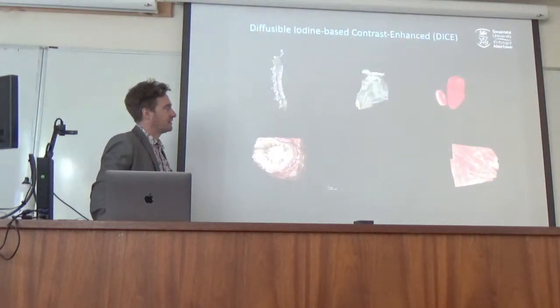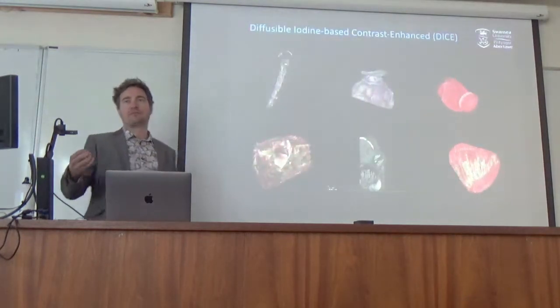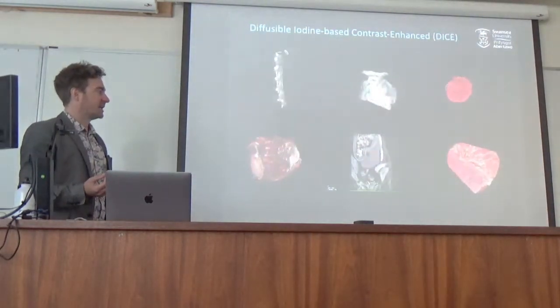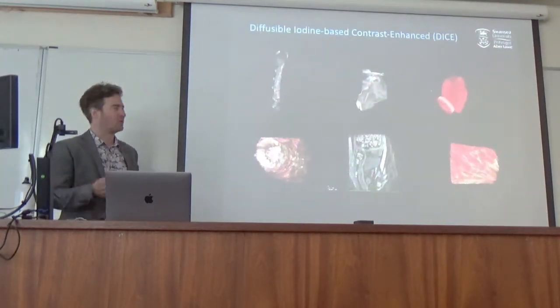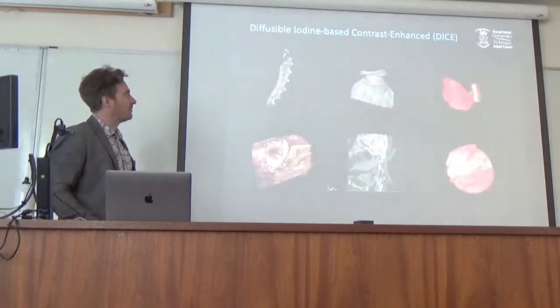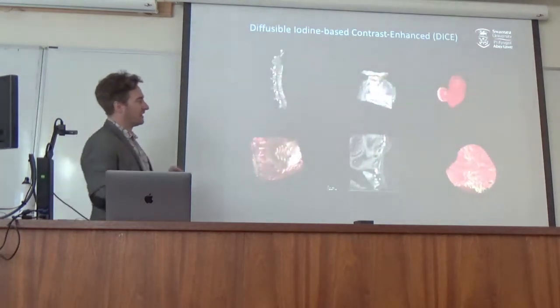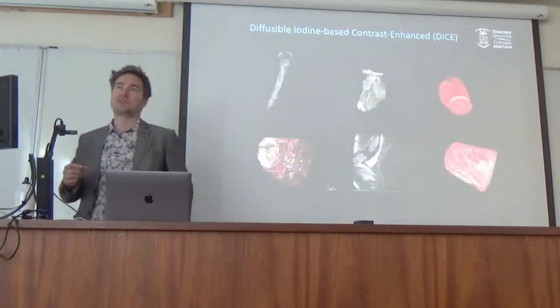To add complexity to our data, it isn't just X-ray attenuation through the structure, but we have biological structures that are soft. So staining, people will probably be familiar with staining of tissue for fluorescence. Well, we can stain for attenuation in X-ray. So all of these were stained with an iodine-based contrast medium. And so essentially we just dunk it in iodine. The iodine is absorbed by certain structures in the soft tissue, and then that means we can then see them, because otherwise we wouldn't get this type of contrast of the structures within soft tissue.